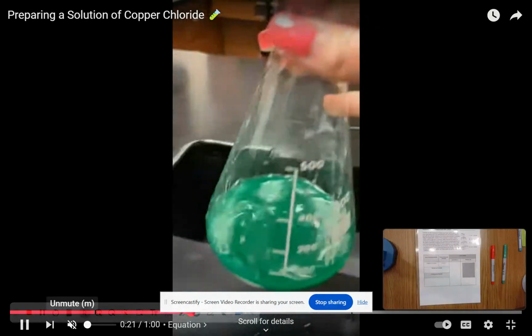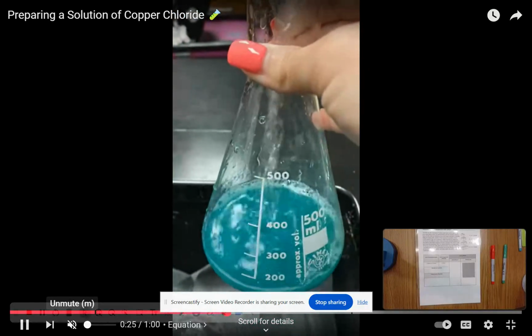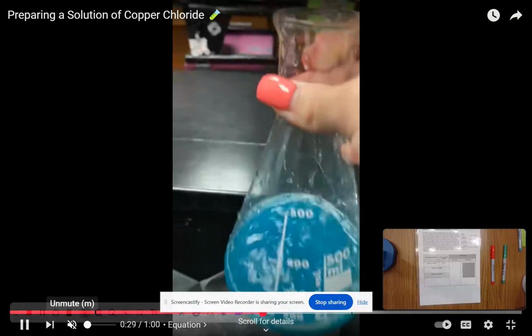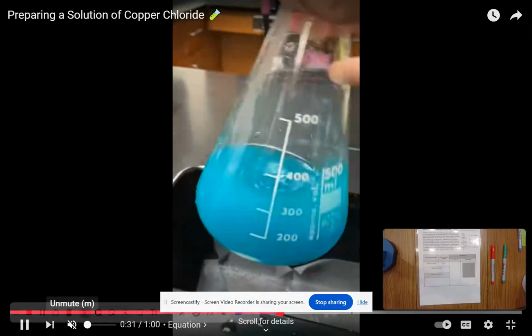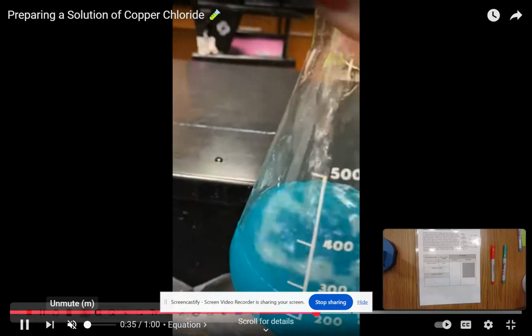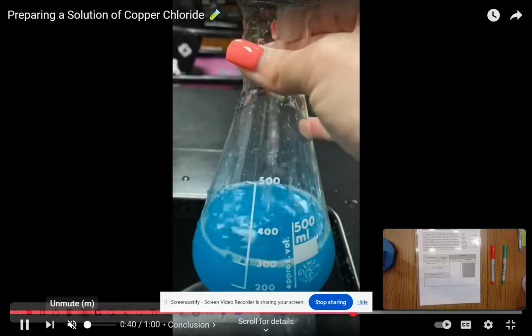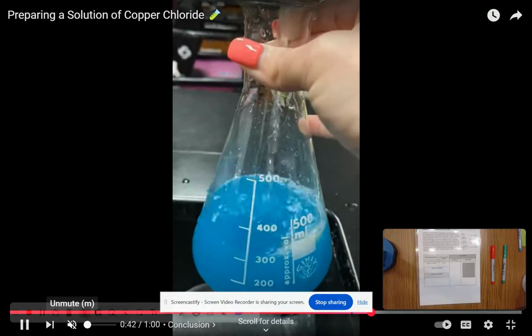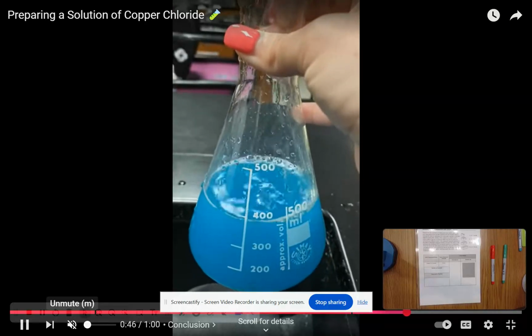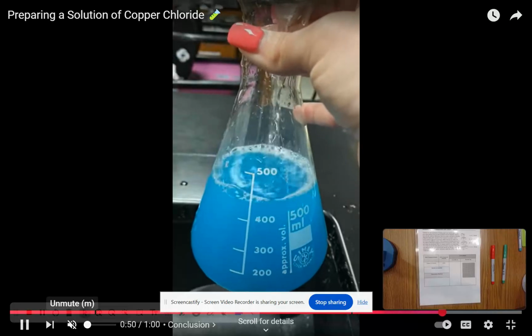And what you're going to see is a clear, which means I can see through it, blue solution, right? So different than what we saw with the copper 2 carbonate, the copper 2 chloride is not settling out to the bottom, and I can tell that because my water would have been clear and colorless, but now the liquid is clear and blue. So that to me is my evidence that the copper 2 chloride would have dissolved in water.